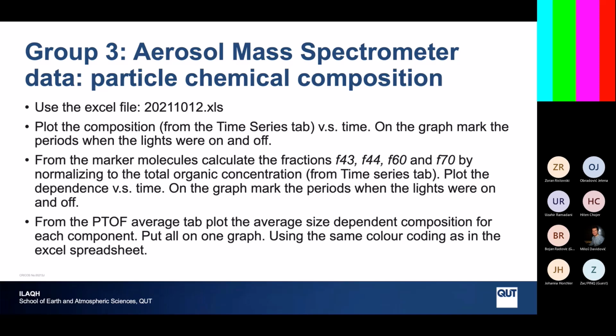And then at the end, we'll all come together and analyze the data. So we'll look at what the RS most depends on. Is it the organics, the total mass, etc.? So to understand that whole issue, we said that the oxidation product is significant for the RS concentration.